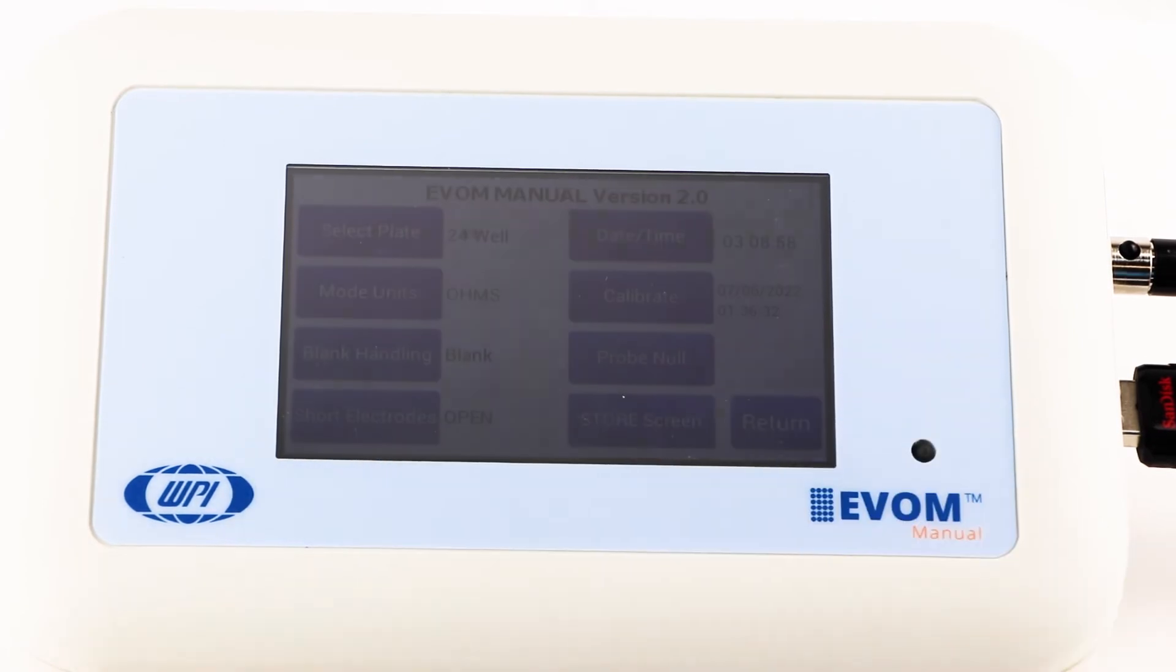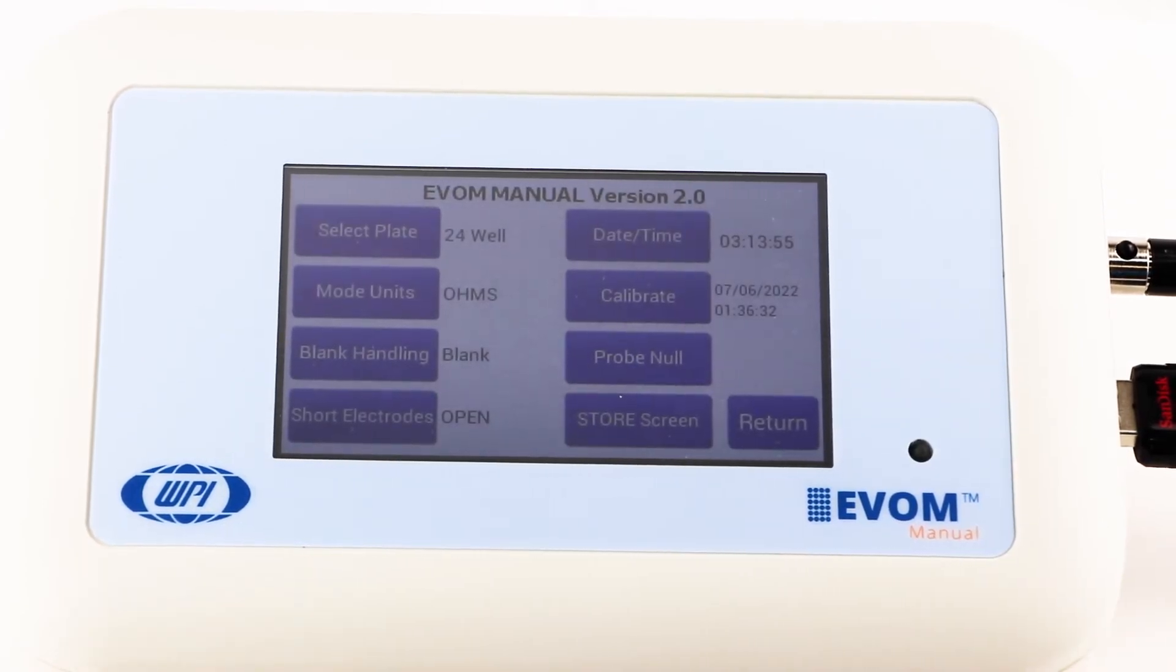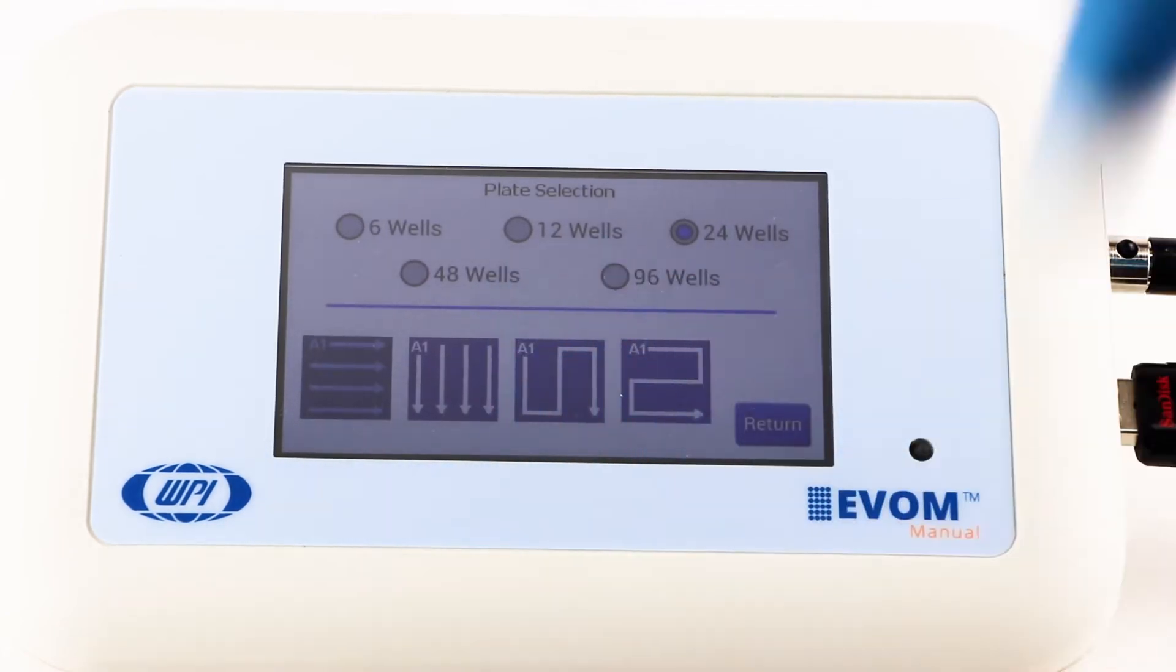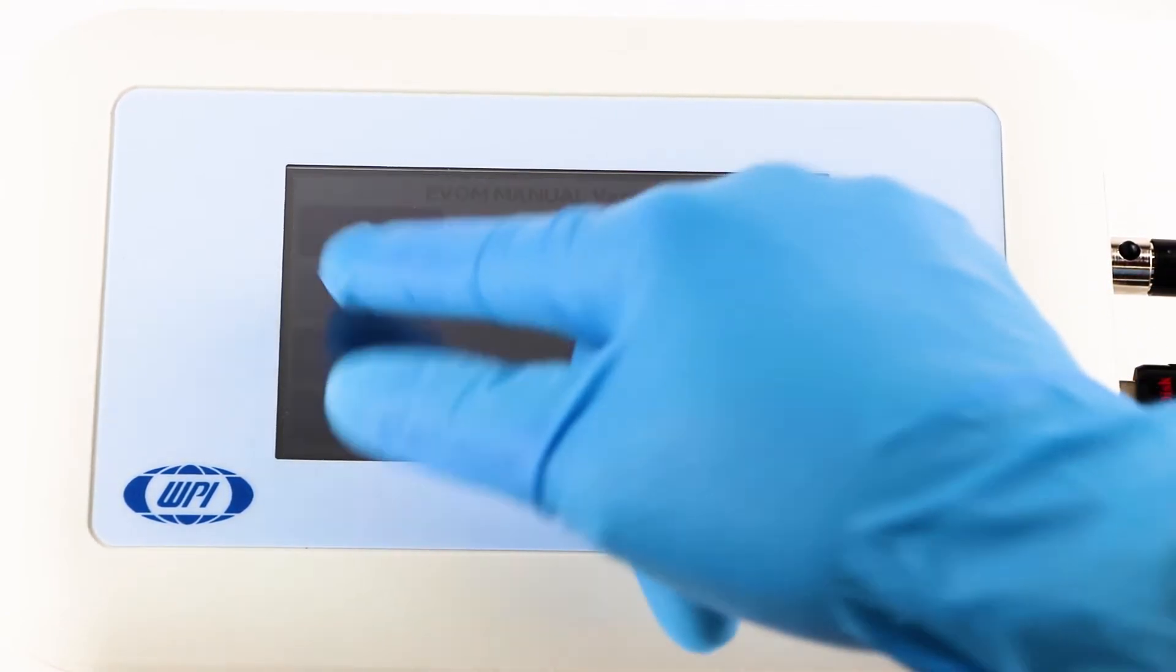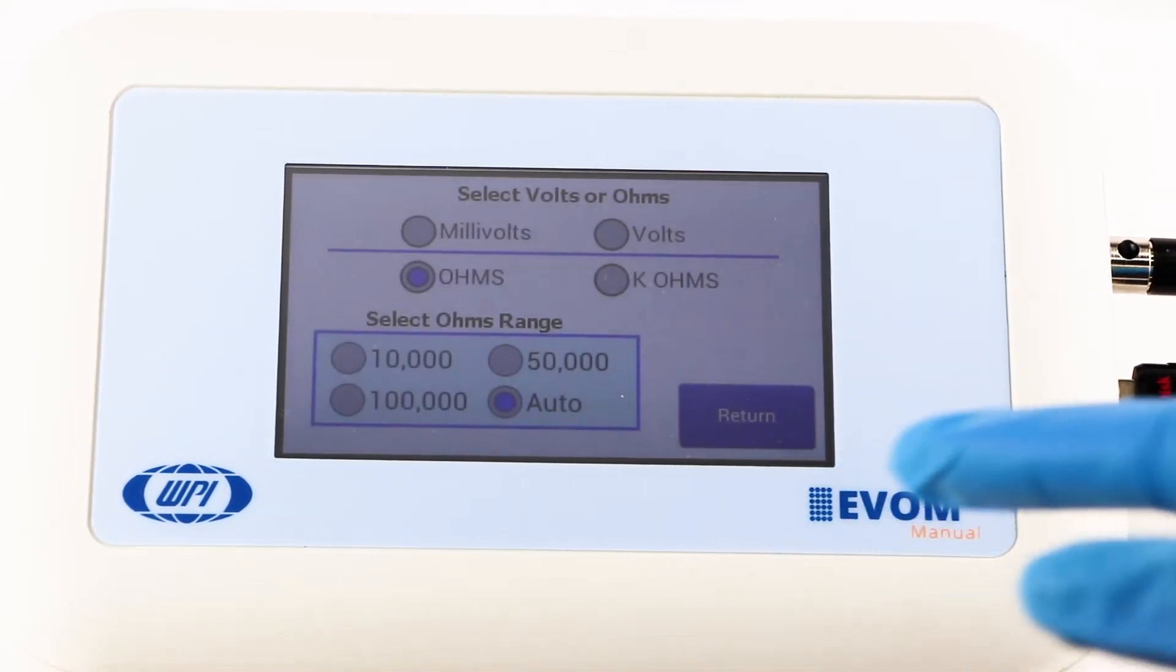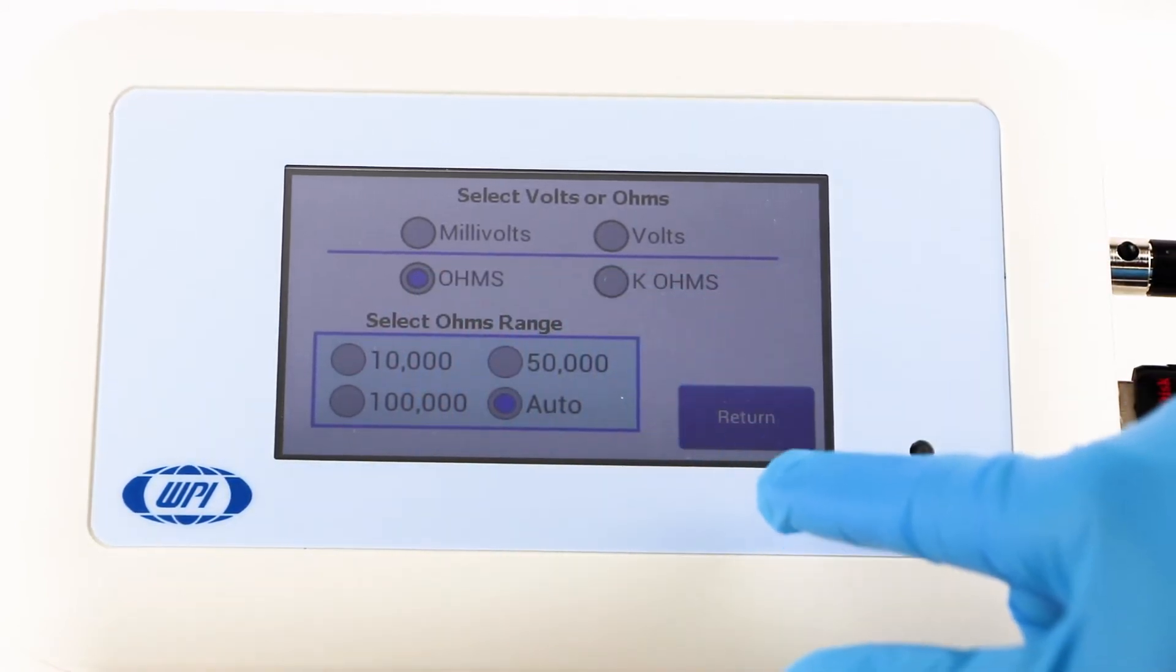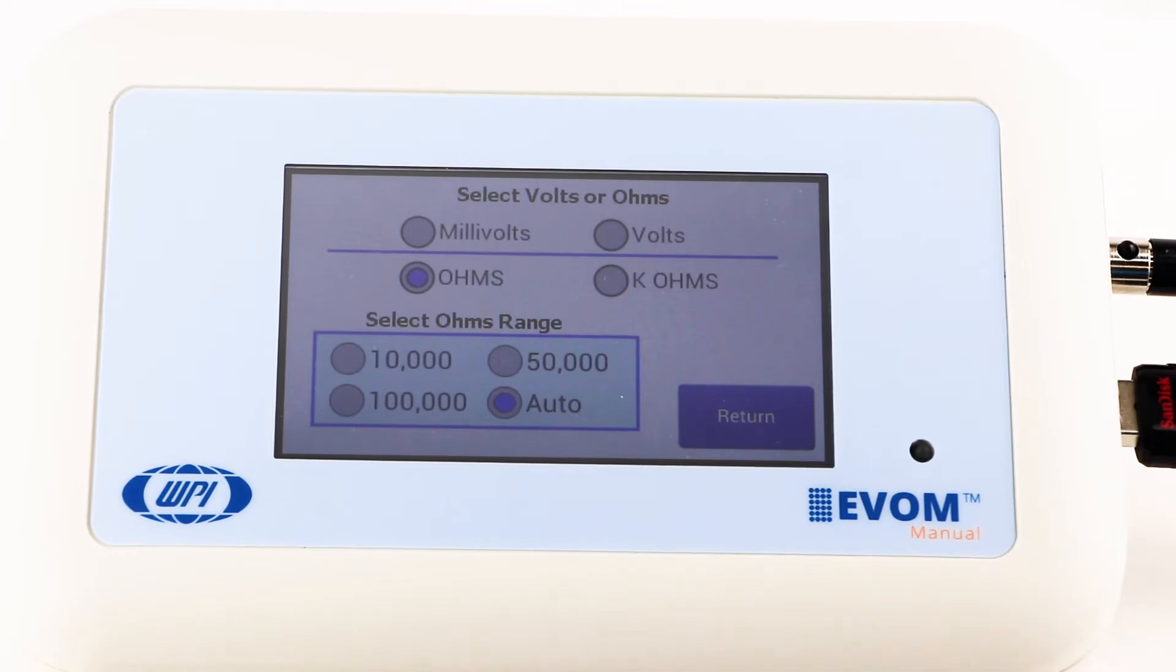Next, press setup to access the setup menu. Select plate lets you choose your plate size. Select mode units lets you choose ohms or kilo-ohms for taking resistance readings. Select the resistance range, either auto or 10,000 ohms.